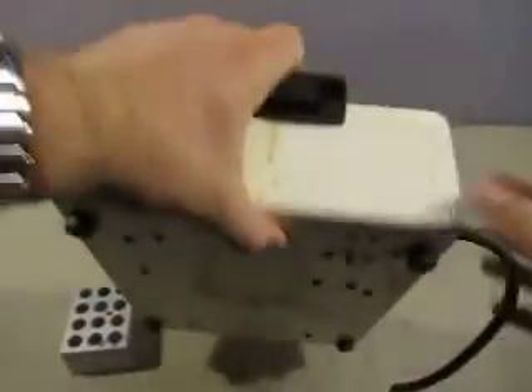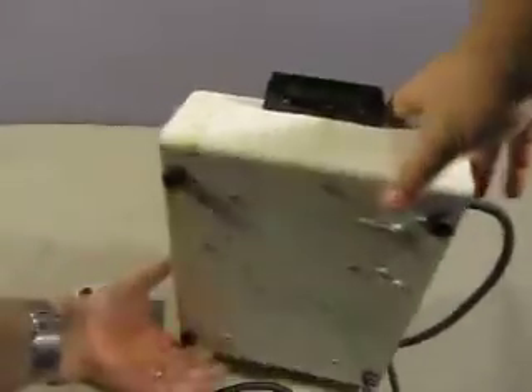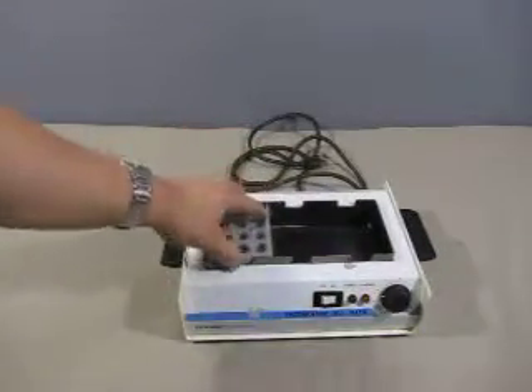And on this side, we do have some staining. The bottom also has some staining — expected for used scientific equipment.